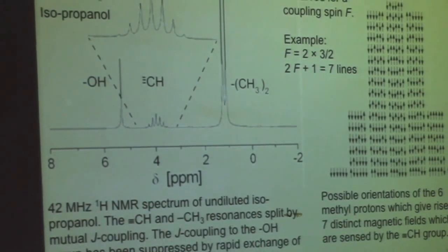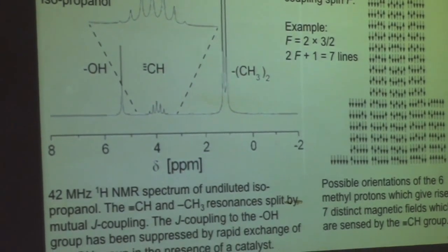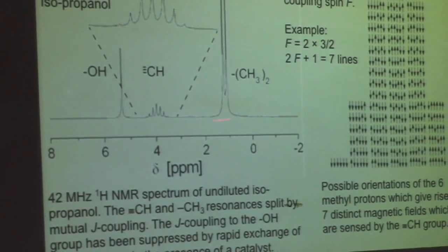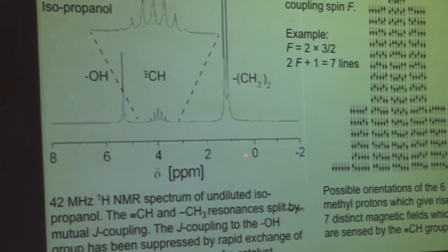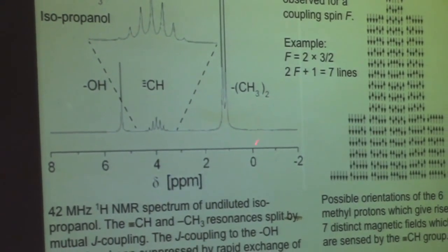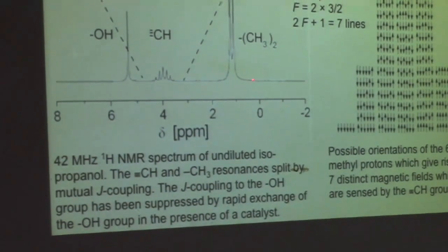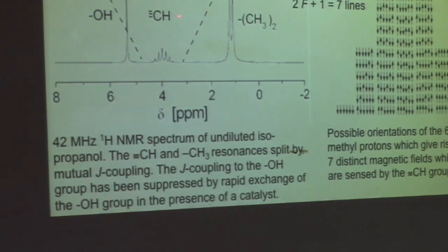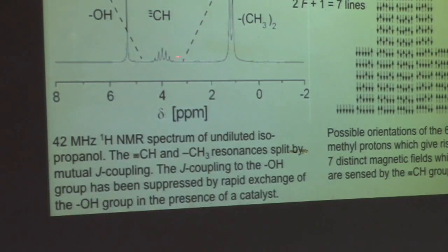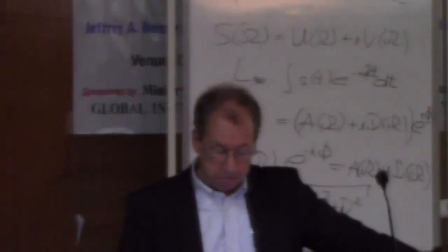But you also see already that the CH3 groups, the methyl groups, are at low ppm values. So here, that's 0 ppm, where tetramethylsilane is by definition. And then you see the CH group over here at higher ppm values, which is far more de-shielded, with the splitting accordingly. The OH group appears depending on the pH, so it can vary; it depends very strongly on the solvent where that appears.